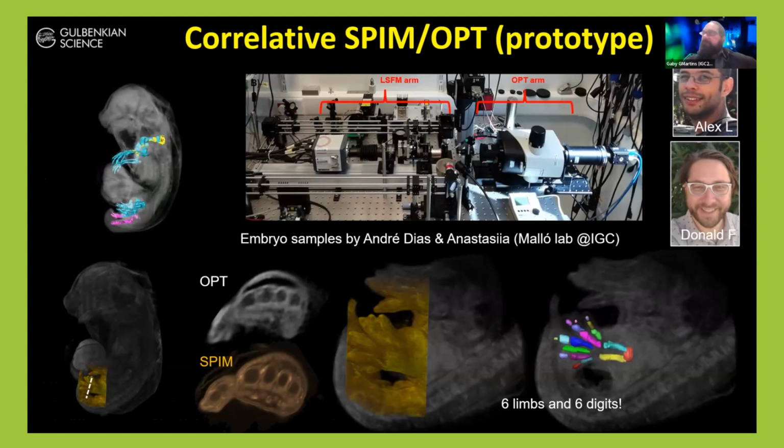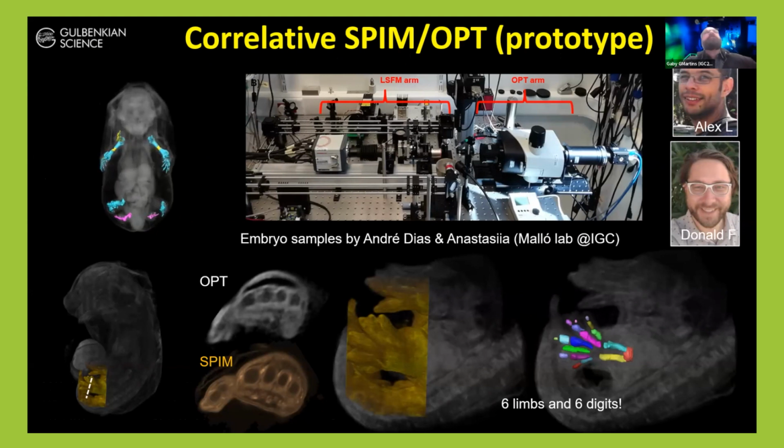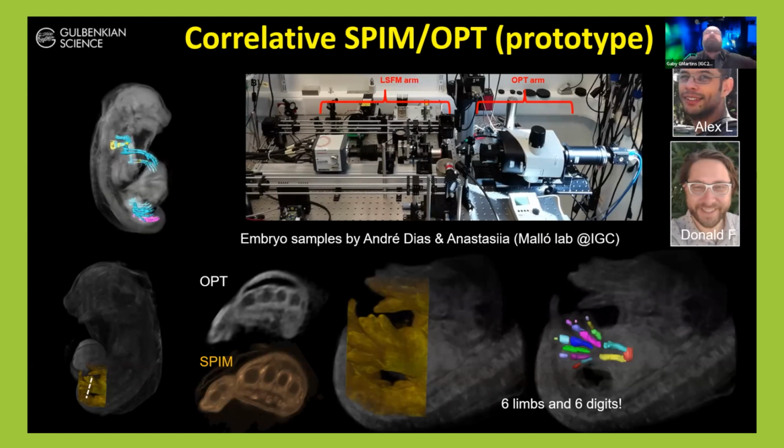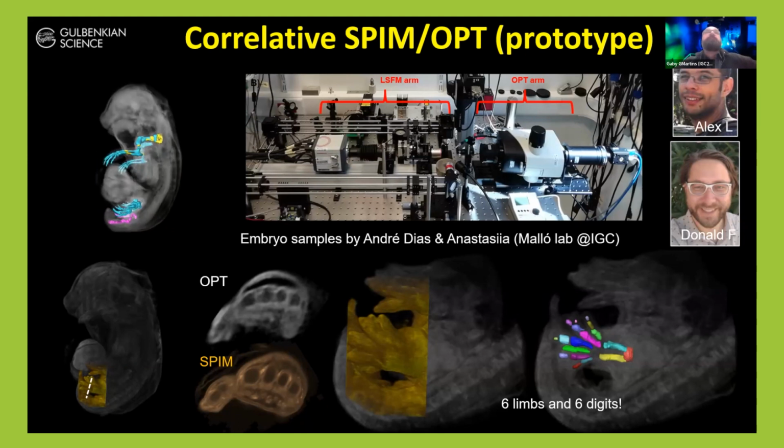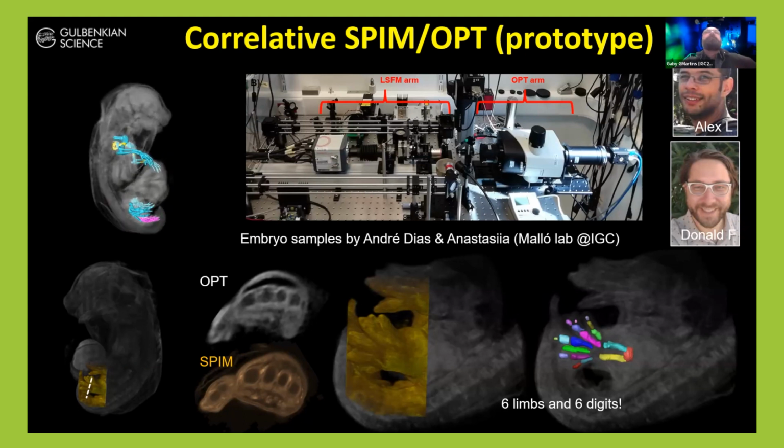I can sort of say, and I don't think it's unfair to say, that you still cannot buy optical projection tomography from any company. You most of the time still have to build it yourself. So that's another reason why open source is so important.